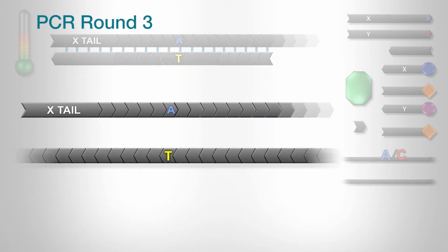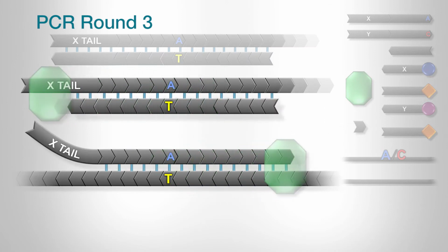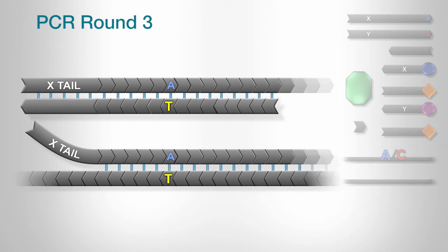It's important to note that whilst this is happening, the original DNA template and other PCR products will be denatured and extended. This is crucial as it results in a continually increasing number of PCR products containing the X complement. These PCR products will enable an increasing proportion of the FAM-labelled oligonucleotide from the reporter cassette to bind and extend during subsequent rounds of PCR.